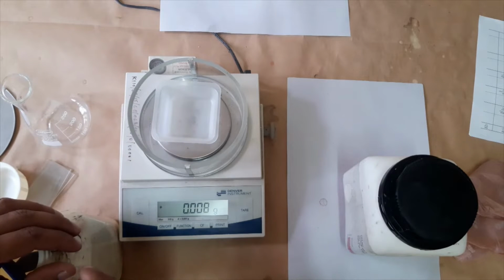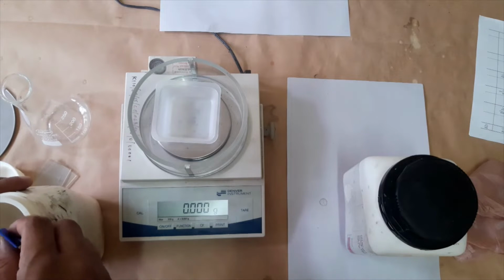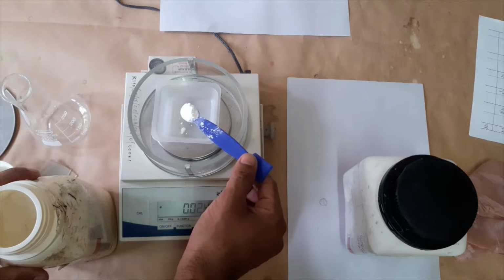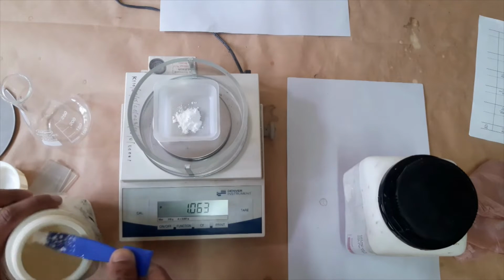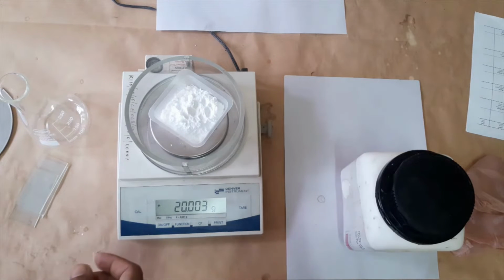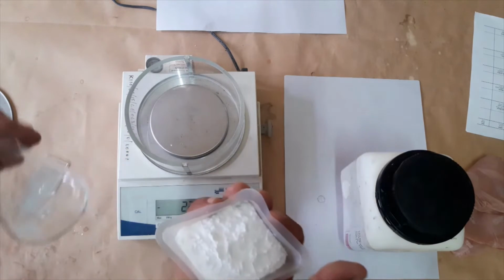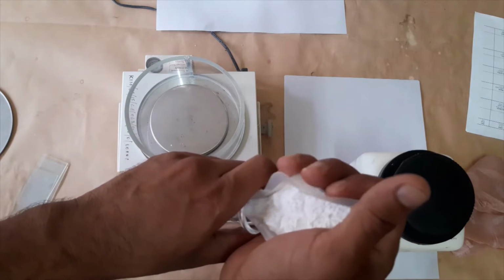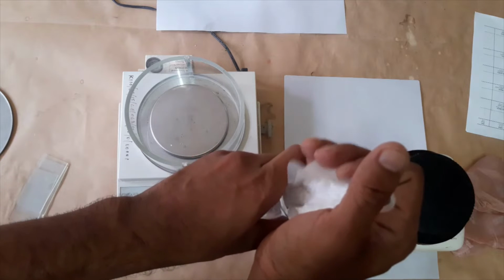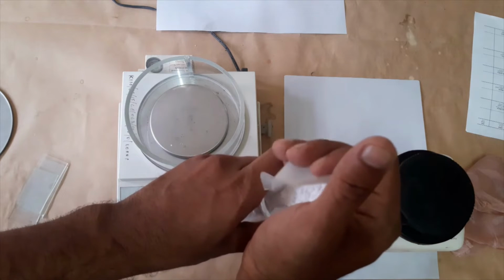I need 20 grams. Okay, I will get this amount. 20.003, the last digit doesn't matter actually. After measuring I will transfer this to this clean conical flask like this. We can add very easily. Okay, that's the first silica gel powder.